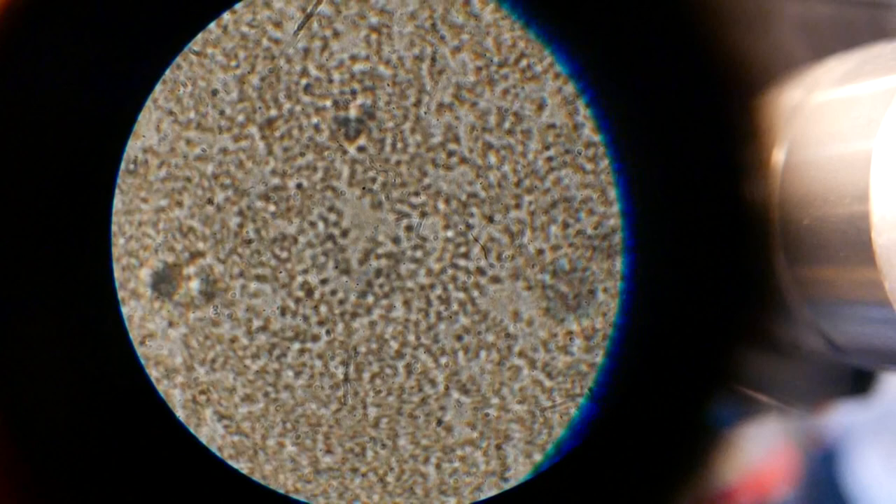Are they trying to eat that? Yeah, that's what they're doing — they're on operation fry. It's not the easiest thing to work with here. So that's that. It doesn't look too good on this screen, does it? No, it looks worse.